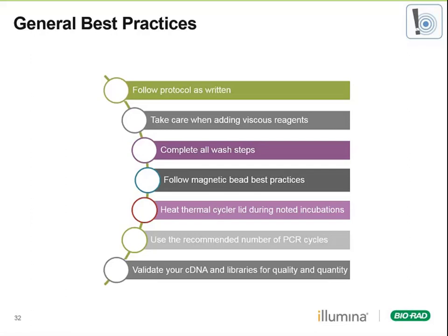We're going to complete all wash steps. Some steps have a particular number of wash steps, and that's important to achieve the desired final libraries. This protocol has a couple of different bead cleanups, so we're going to want to follow the magnetic bead best practices, which are listed in the reference guide and also on the SureCell support page.